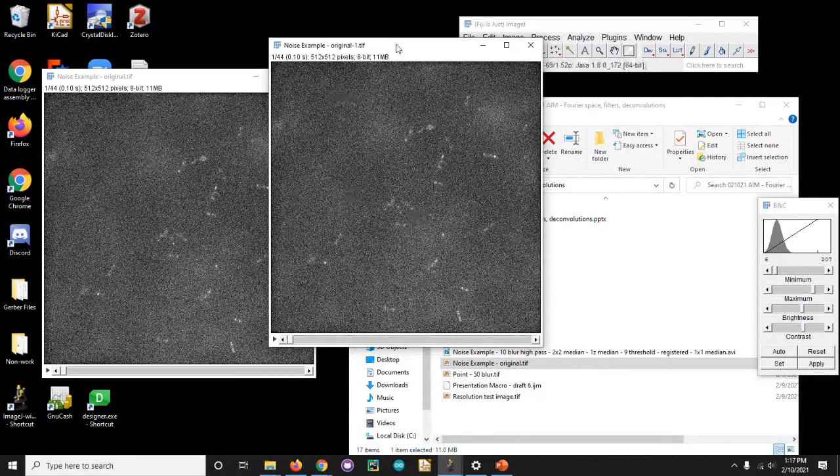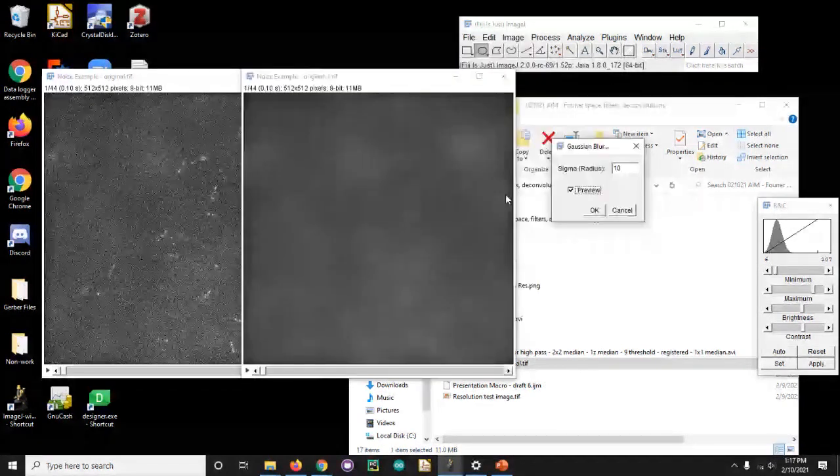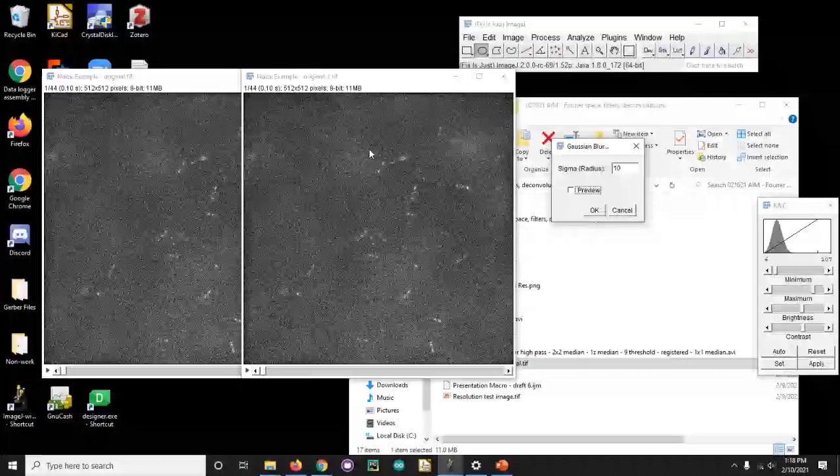You can see, we haven't really changed our background. So not the fine detail in the background, but this sort of large scale ripple pattern. And we can jump to 10. And now you can see we still have that ripple pattern. We're going to try and ignore the bacteria pixels and just think about that ripple pattern. So I see like this wave right here. If I remove it, I still see that same wave pattern. And now you can see I've gone too far, right? Because even my background wave pattern is starting to smooth out compared to a 10, right? So now we have more detail of the background.